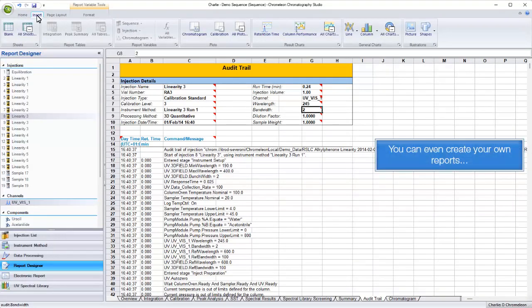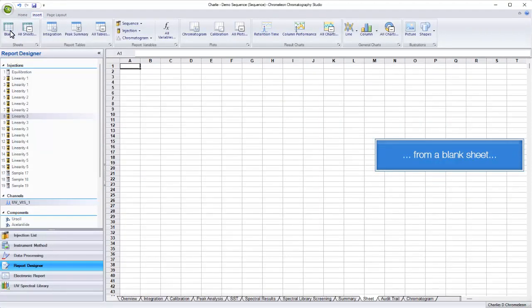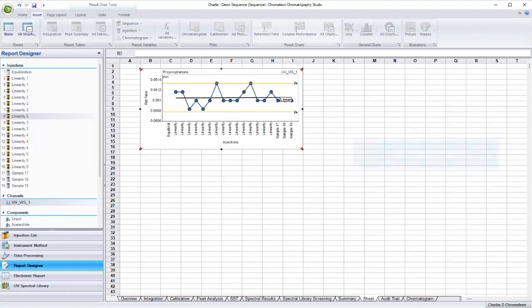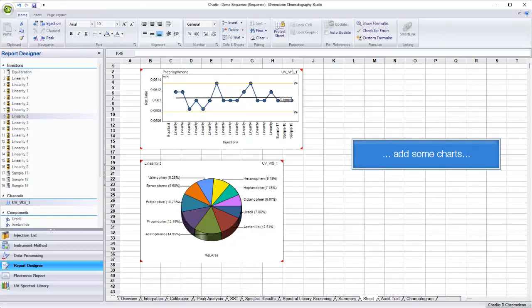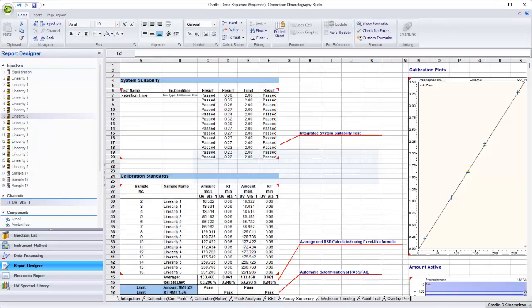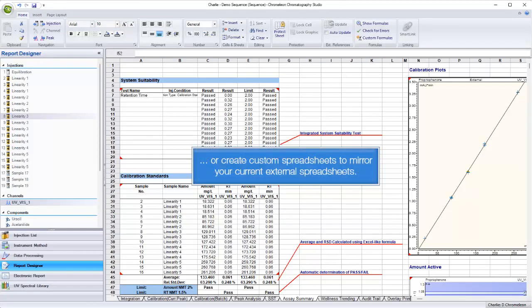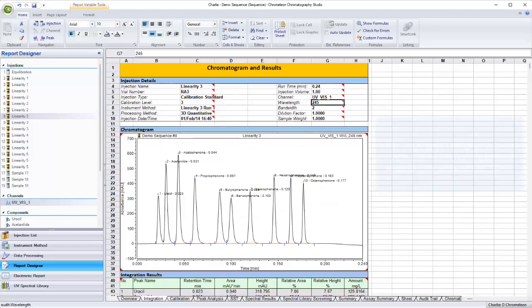You can even create your own reports. From a blank sheet, add some charts, or create custom spreadsheets to mirror your current external spreadsheets.